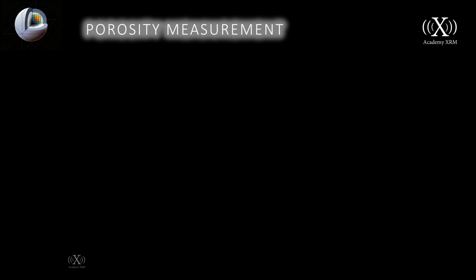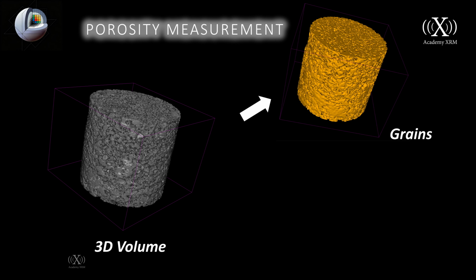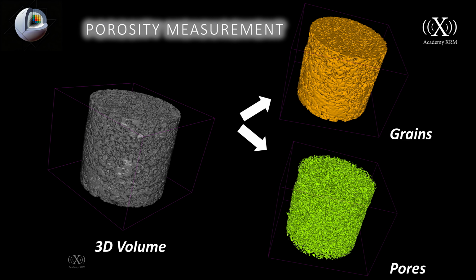In this video, I'm going to show you how to correctly calculate porosity in 3D Slicer by properly extracting the pore volume from your sample. I will also cover a few important pre-processing steps that you need when working with non-DICOM image stacks, so you can bring your data into 3D Slicer without running into problems later on.